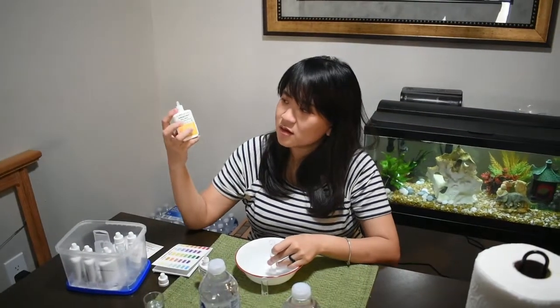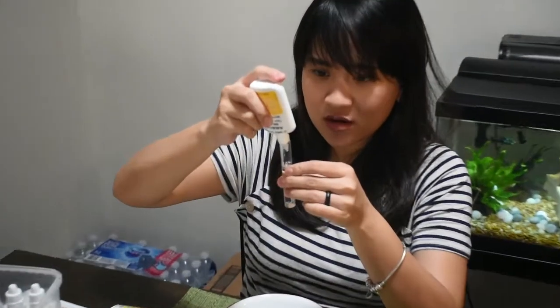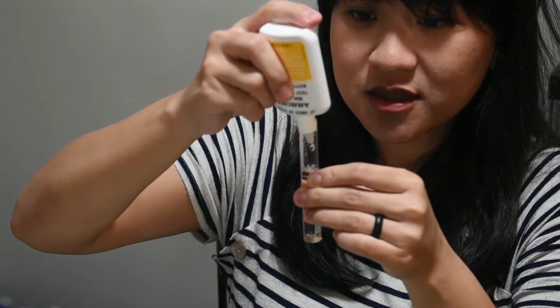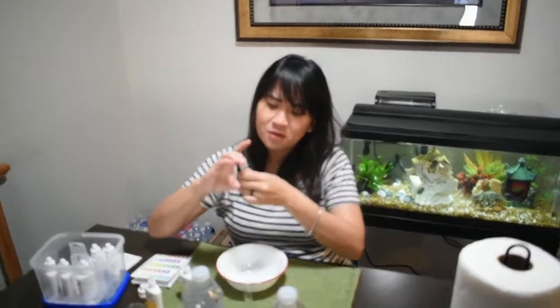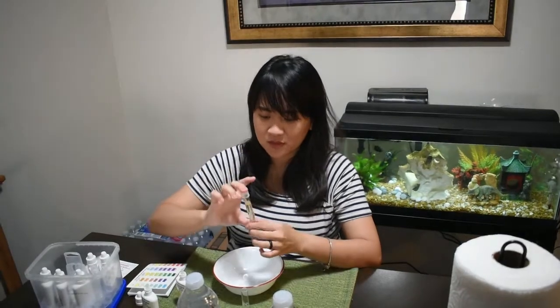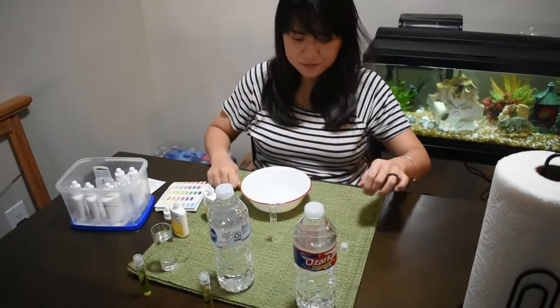Then the second bottle at 8 drops. That's it. And we close this cap again, and we shake for 5 seconds. That's it. I will put this in front of the bottle.